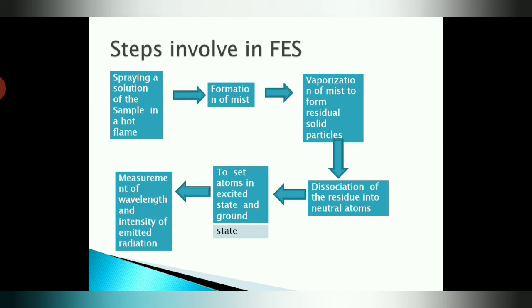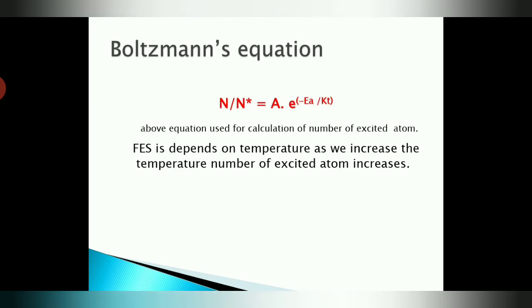This sixth step is very important when we consider the instrumentation of flame emission spectroscopy. So in this technique we use the Boltzmann equation. What is the Boltzmann equation?